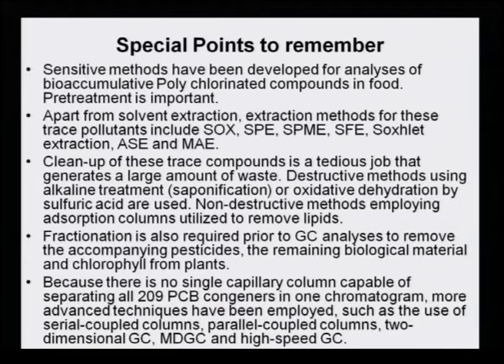Cleanup of these trace compounds is a tedious job that generates a large amount of waste. Destruction methods using alkaline treatment, that is saponification, or oxidative dehydration by sulfuric acid are used. Non-destructive methods employ adsorption columns to remove the lipids. Fractionation is also required prior to GC, that is the gas chromatographic analysis, to remove the accompanying pesticides, the remaining biological material and chlorophyll from the plants.